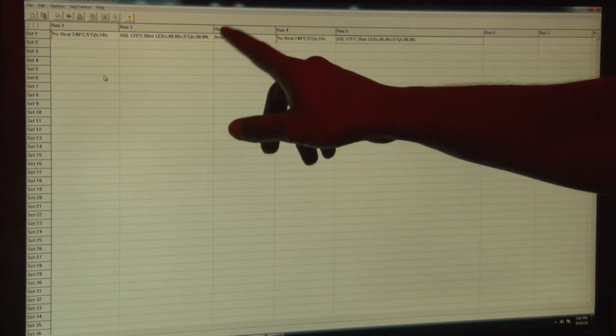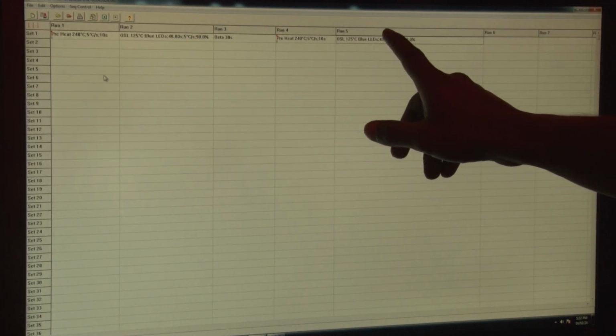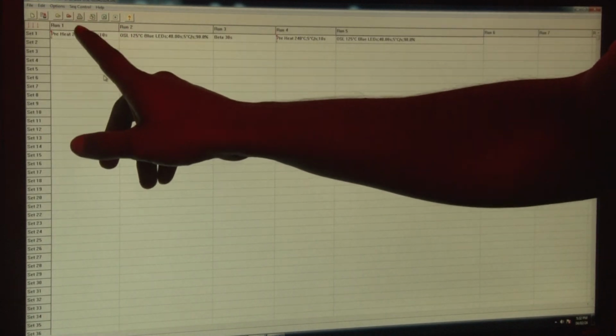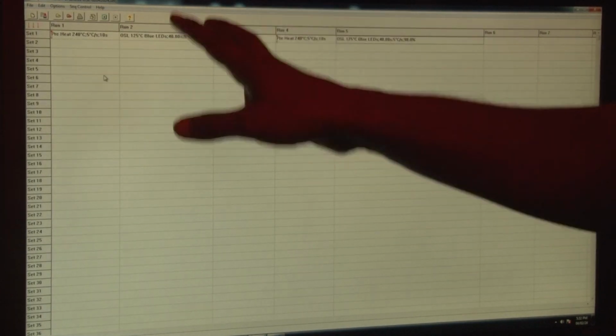Here what I am trying to say is that if you are giving 30 seconds and you are getting 220 photon counts, what would be the dose if you are getting 170 photon counts for this? You have to compare both of this data and you would get the dose in nature. So this was the part of estimating the equivalent dose.